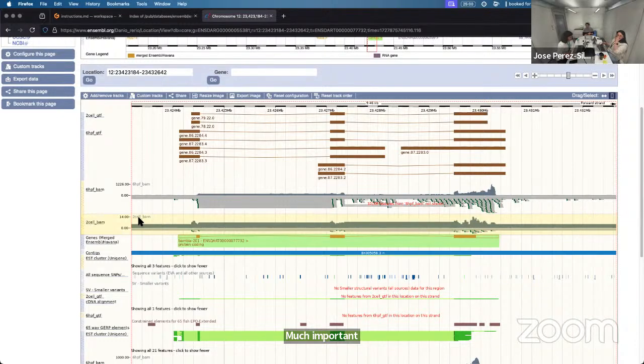Now, these are results that you have to take with some care, because for these results, in terms of expression, to be truly significant, you need to have some, oh, sorry, I'm missing the word in English. Some control that you know is quite ubiquitously expressed.